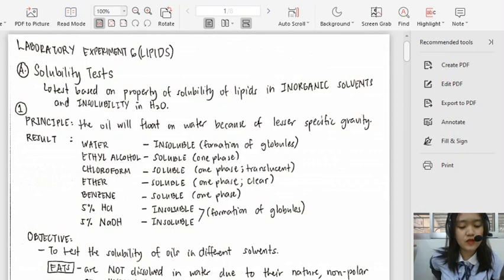Ha, class? So, don't mix the reagents and the samples in your test or subtest.